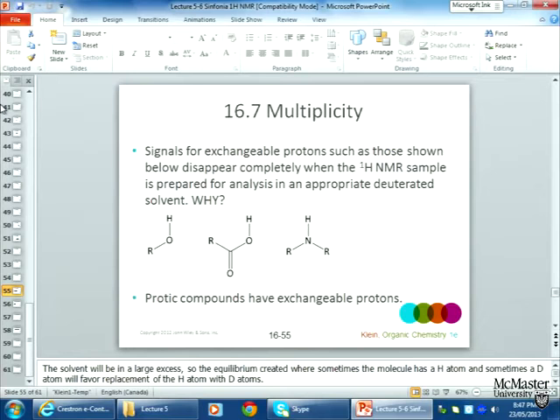So you have to retune your NMR machine to a special frequency to do deuterium NMR. The reason that we use deuterated solvents in NMR is that the deuterium doesn't show up in the proton NMR. So if I exchange the OH proton of an alcohol for an OD, then that ceases to show up, at least in the proton NMR.